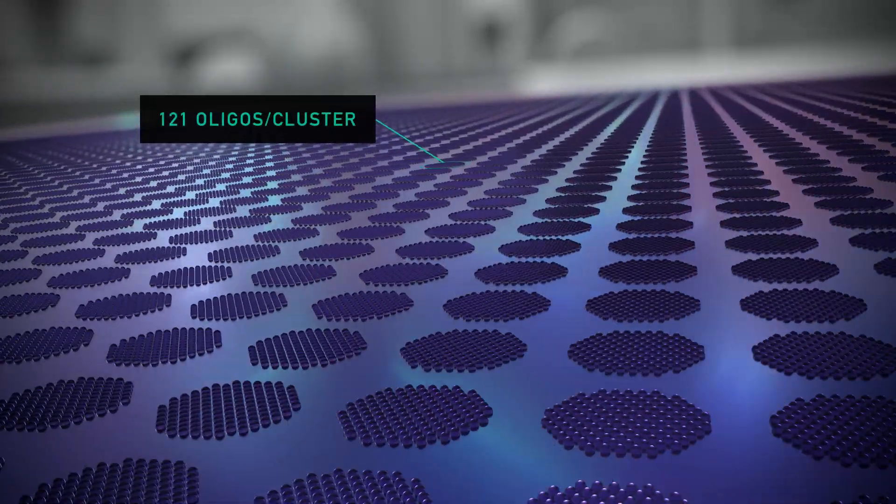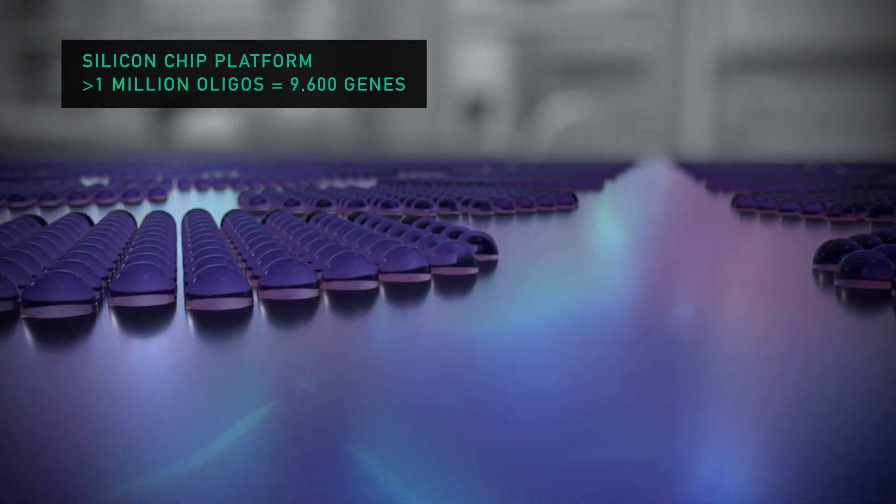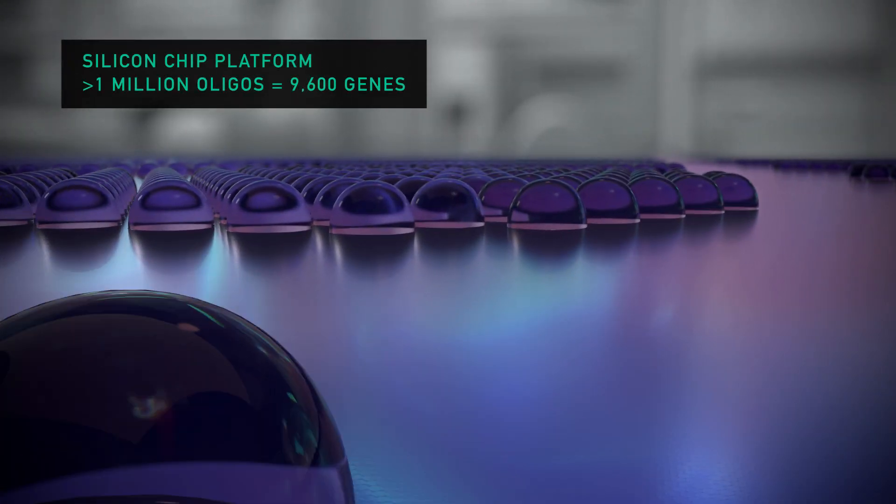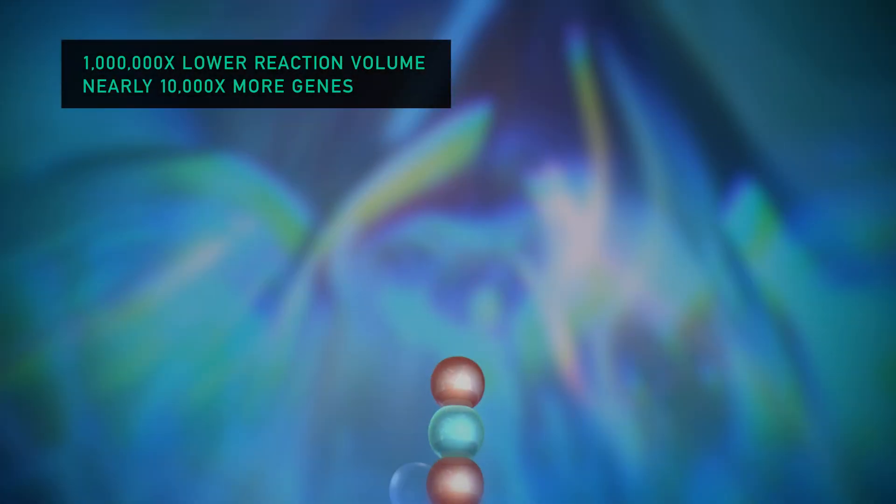With micro-scale patterning, the resulting silicon chip is able to write over 1 million oligonucleotide sequences to generate nearly 10,000 genes at a time.